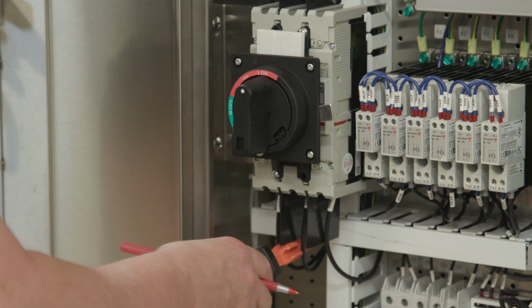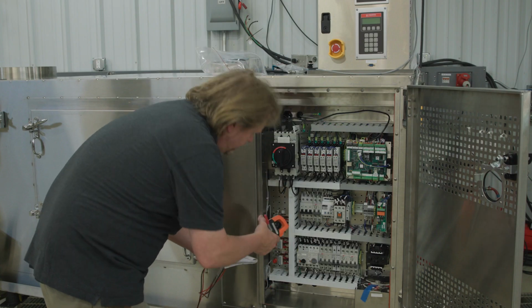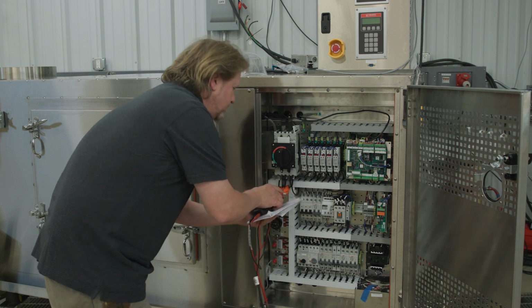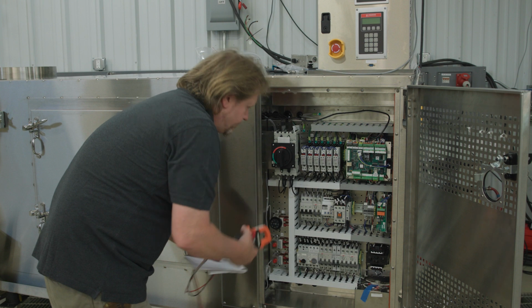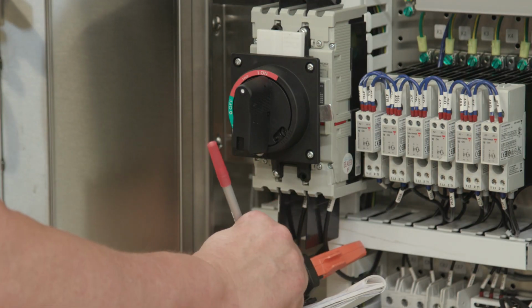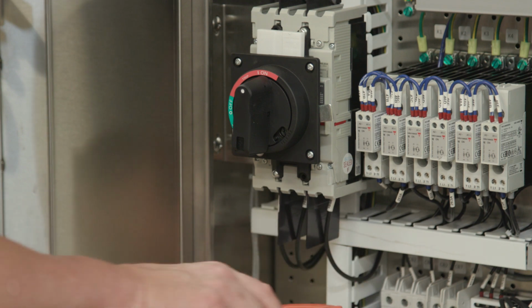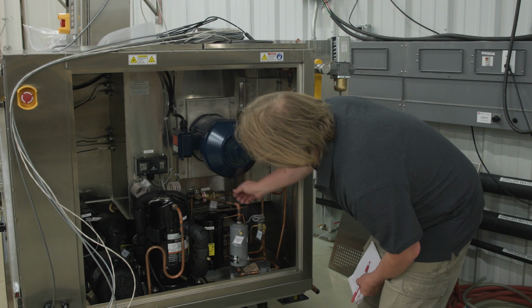Line amps number 1. Using a multimeter, check and record the main line current for each phase, if it is a 3-phase power supply. Verify the hot gas bypass valve operation.